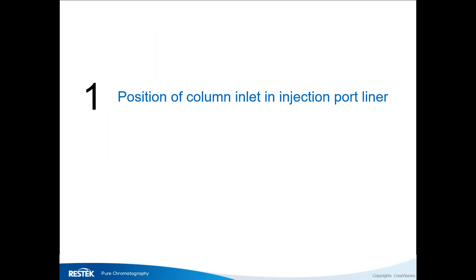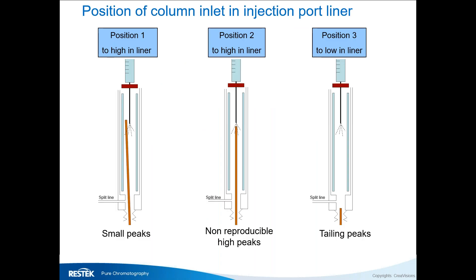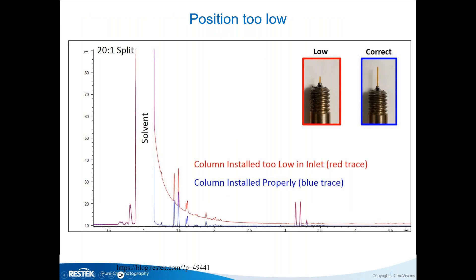We start with the position of the column in the liner. If you shift it up too far, you inject below the column inlet and get very small response. If you put it at the same level where you inject, you get non-reproducible, very big peaks. If you put it too low, you also have a problem — you get tailing.